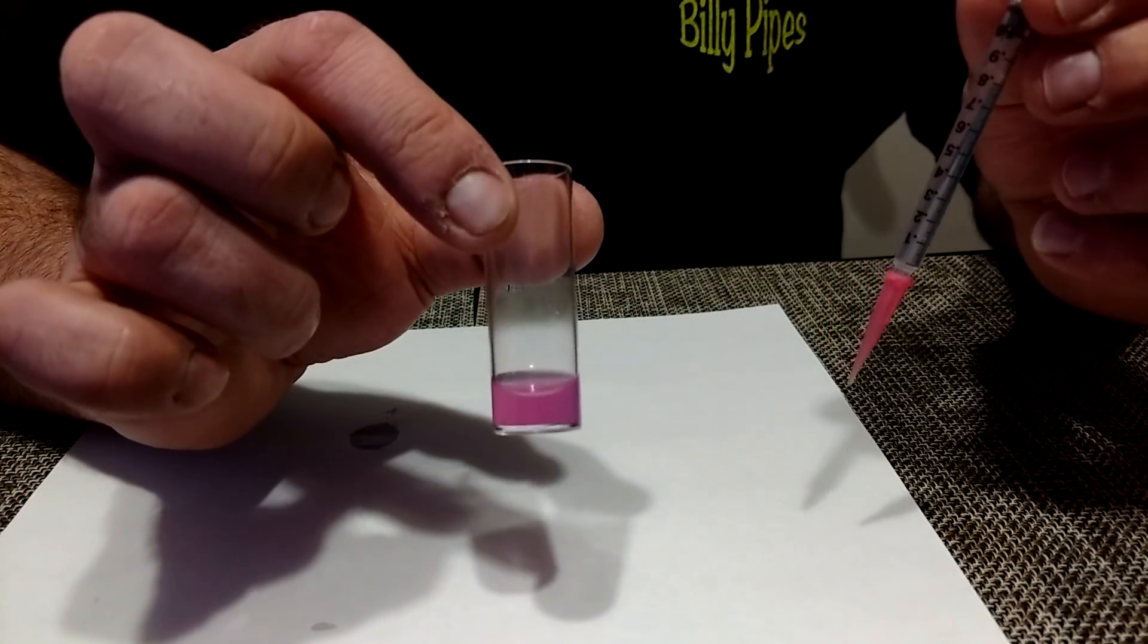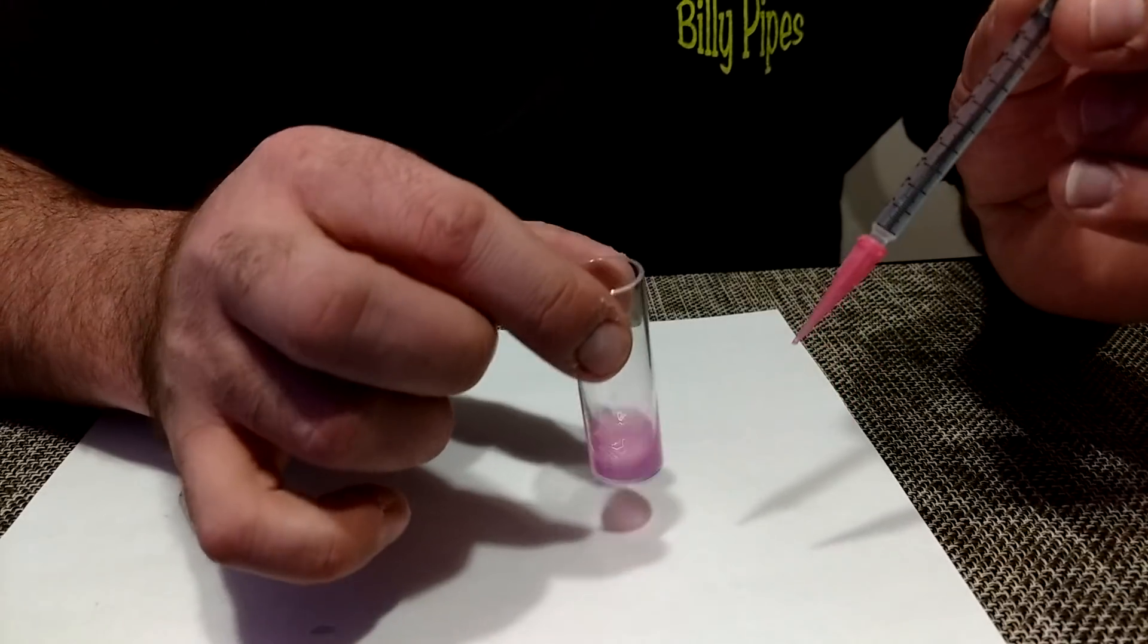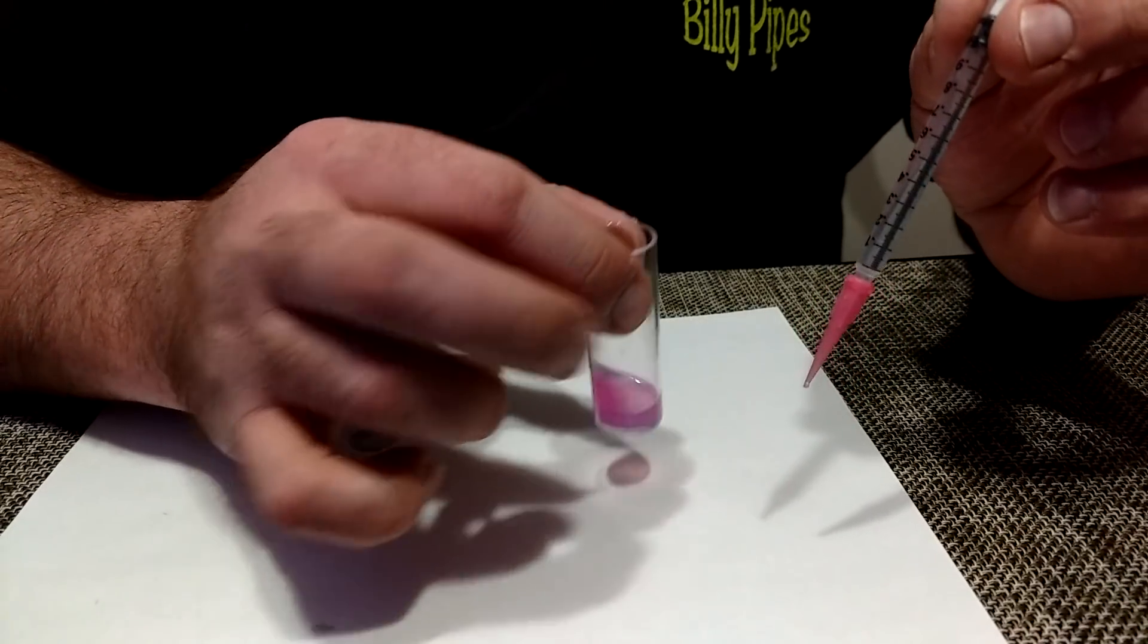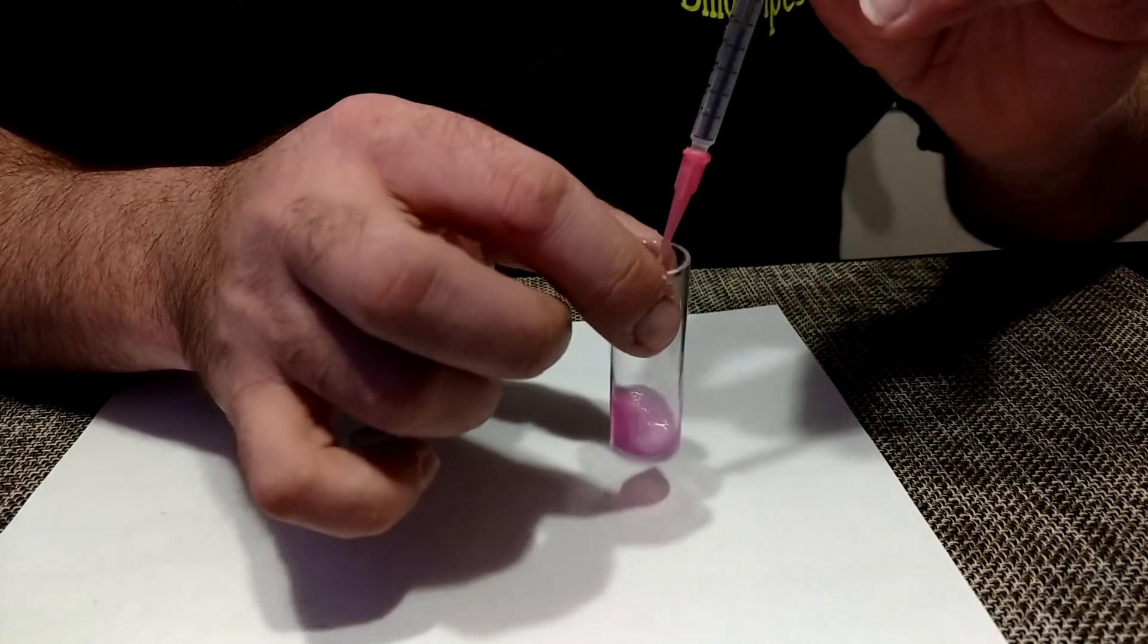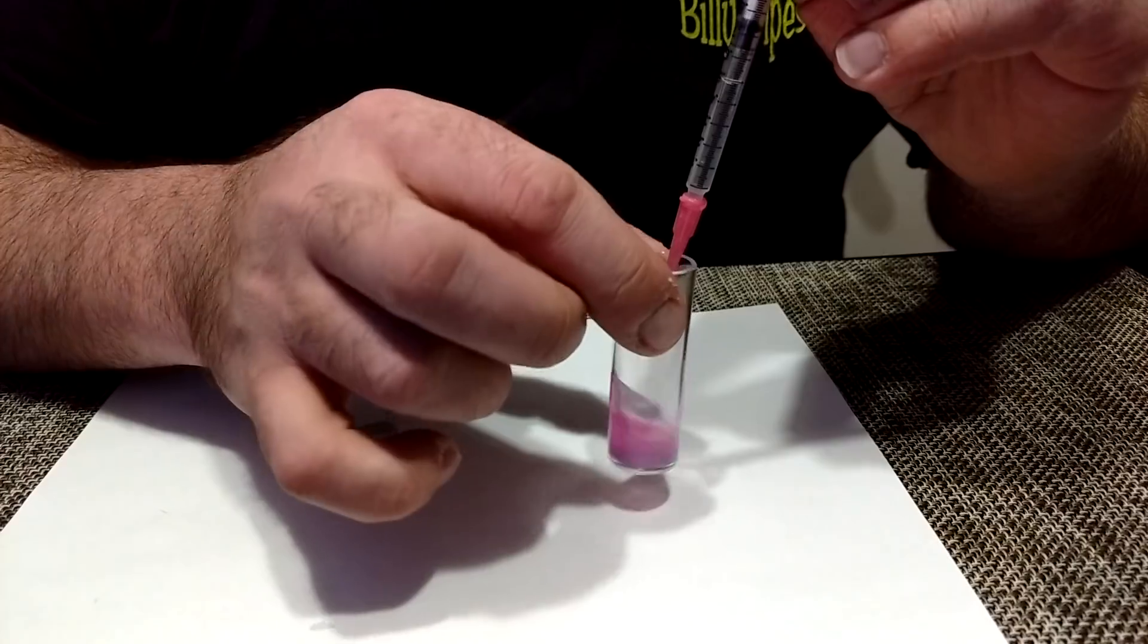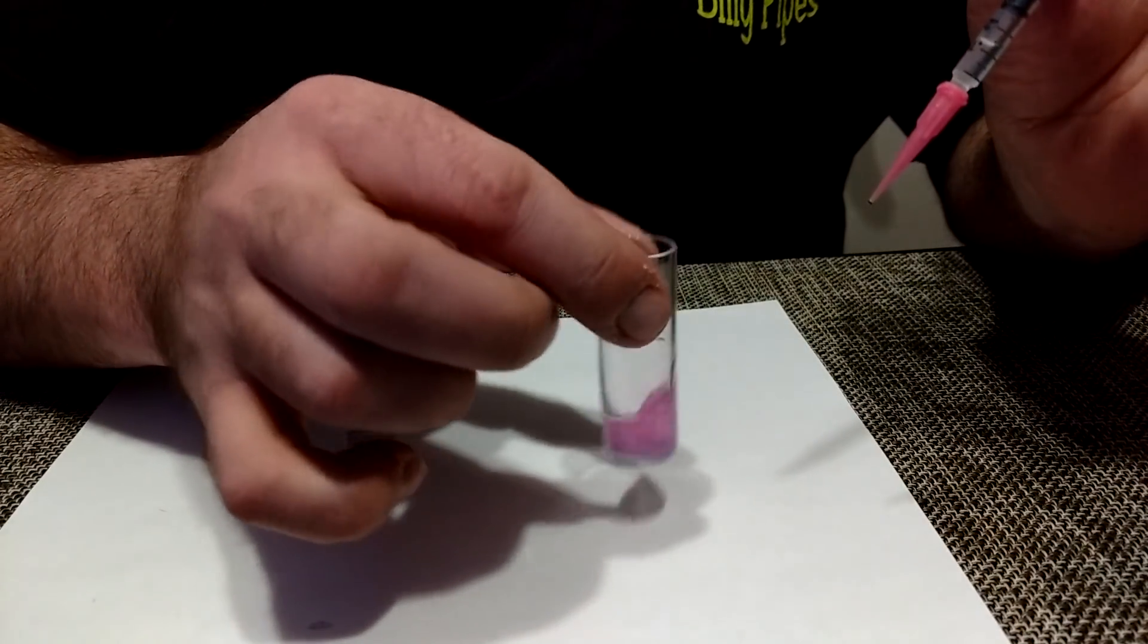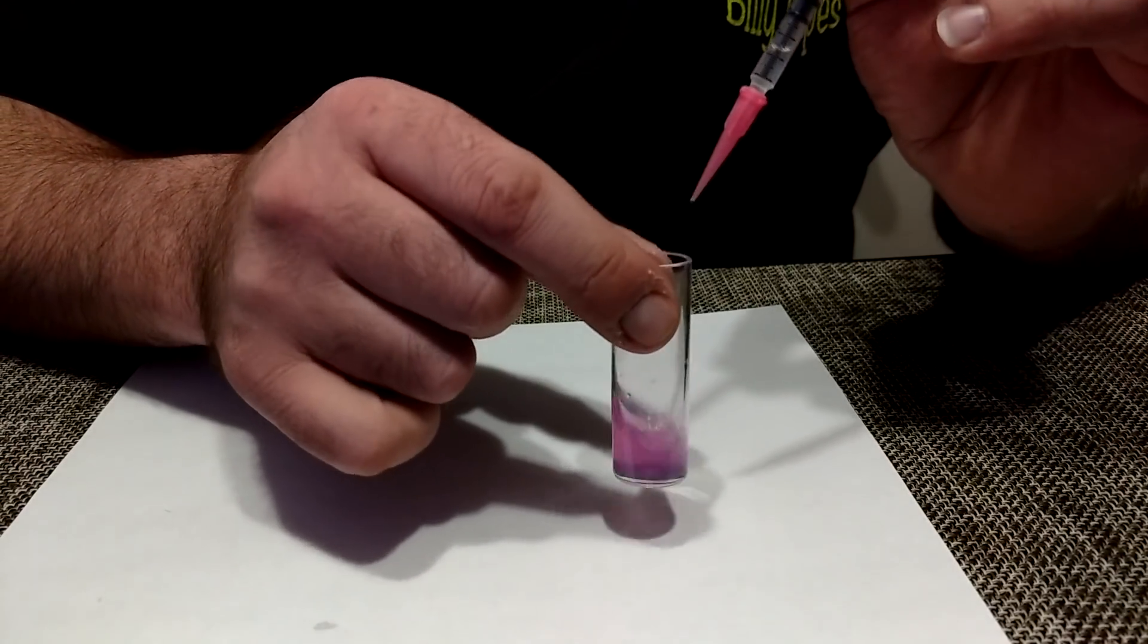Then what you want to do is continue mixing and adding the fluid at the same time. You can go all the way down to about the .3 milliliter line right off the bat. Keep mixing. It's going to be this purple. It's going to change to a blue color.